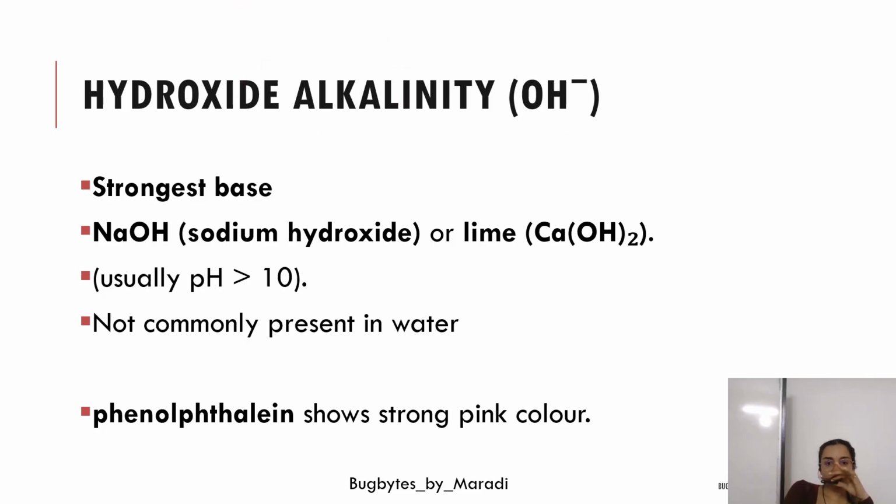As you all know, OH minus or hydroxide is the strongest base out of all the three: hydroxide, bicarbonate and carbonate. And usually in the laboratory, if you're preparing the sample for alkalinity, just to get this hydroxide alkalinity, we'll be using NaOH, that is sodium hydroxide.